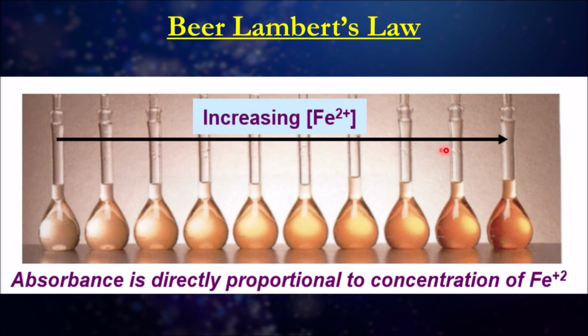So if we're increasing the concentration of iron as we go along here, you can see that with this intensity of light, it absorbs a lot more of the bluer colors than the lighter colors here. So this is absorbing a lot more light. That's why we see a much more distinct color. This has a much more diluted, transparent color, which means a lot more of the other wavelengths of light are coming through. That's why we can't make out as clearly what the distinct color would be.